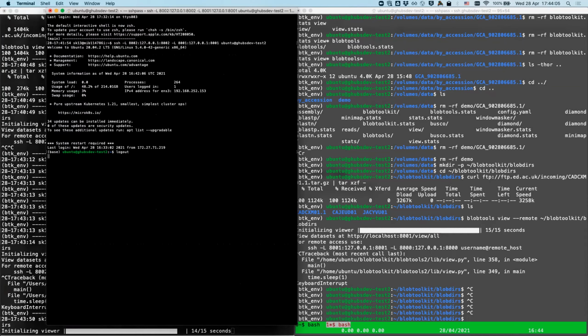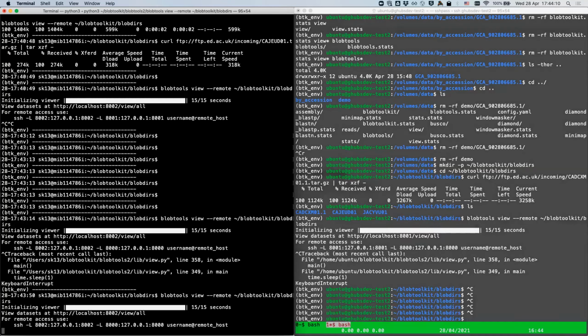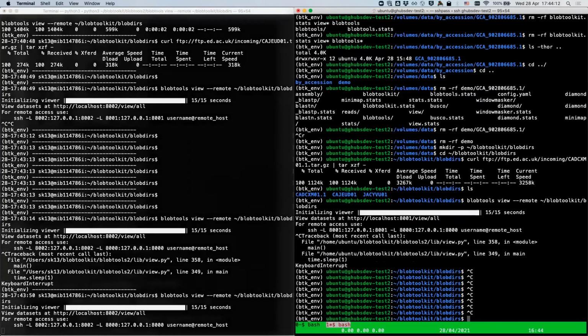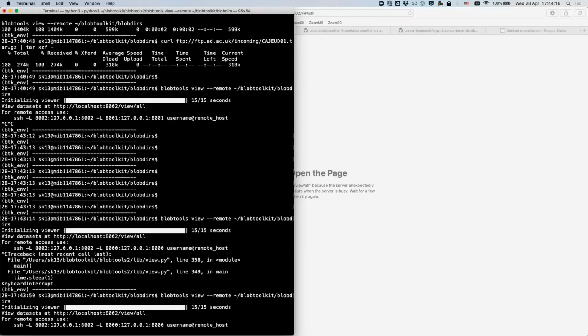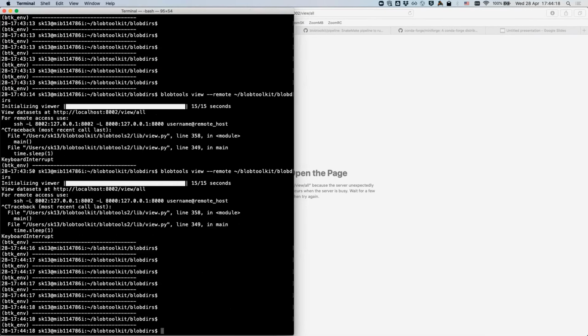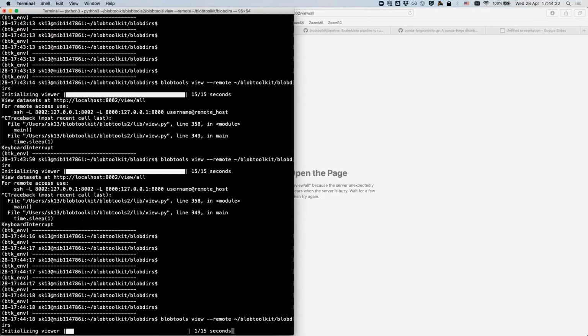I'm going to close the server. For people that it worked for, I'm very glad it worked for you. I'm going to close everything and start again. Close that. It does work, I promise you. Yeah, I repeated everything and it worked. I now have the 3 files. Fabulous. Okay, so it does work. It's just me confusing myself and we only have 15 minutes.